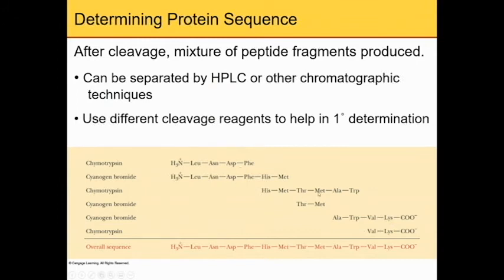Then by doing the arrangement, you can figure out the correct arrangement of the peptides. Question. This will be on exam 2. So to analyze the peptide through different digestions, you'll be able to arrange those small peptides and come up with this.